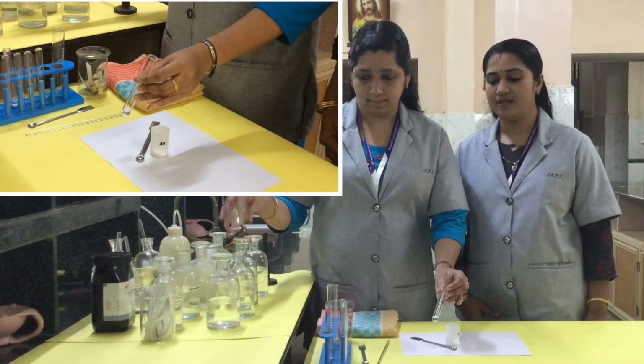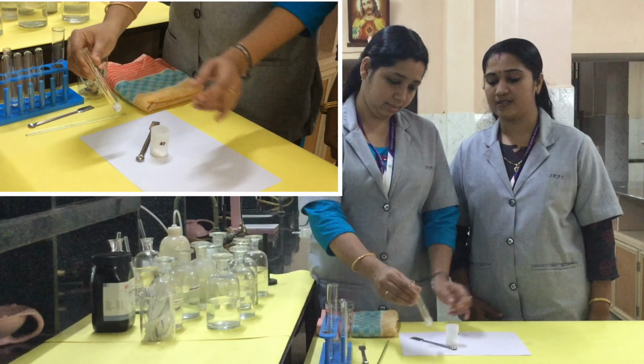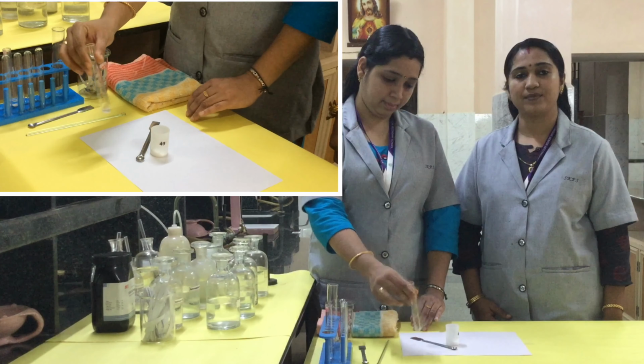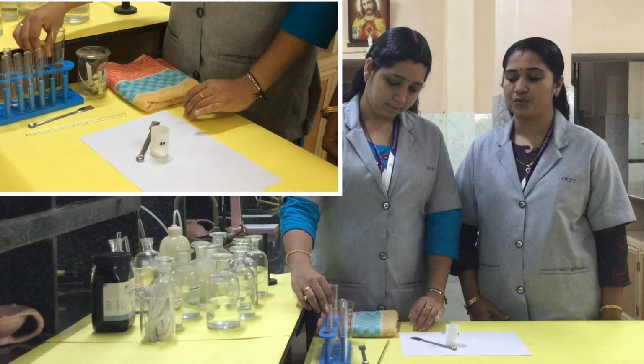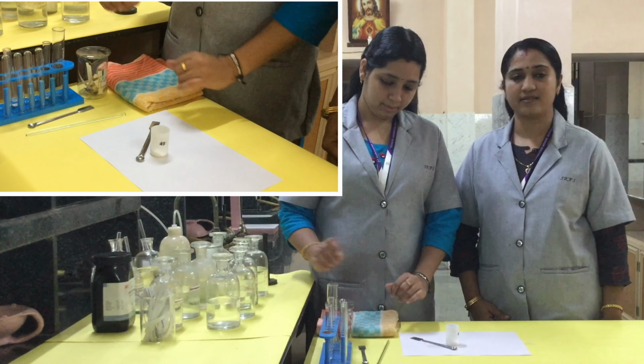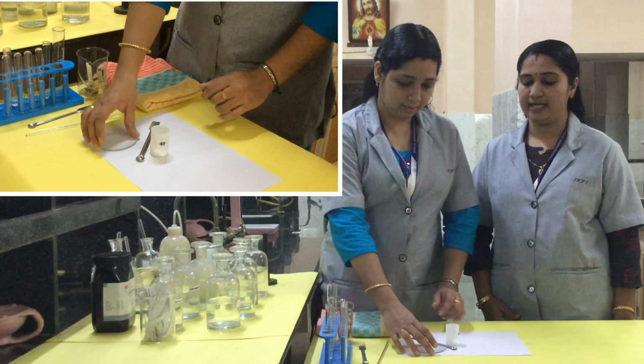No brisk effervescence is observed. So carbonate is absent. The test is negative. So we will have to repeat the experiment for the next anion, that is acetate.